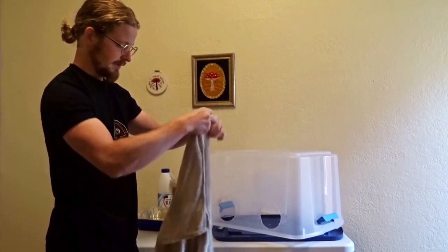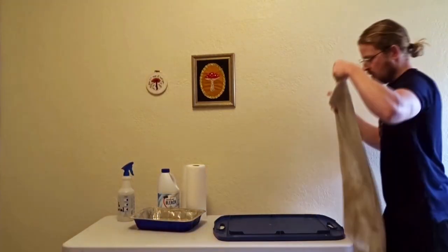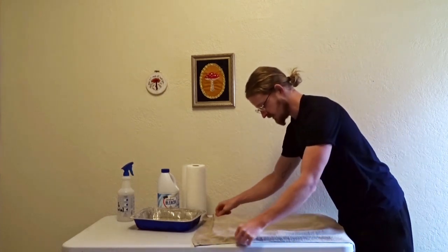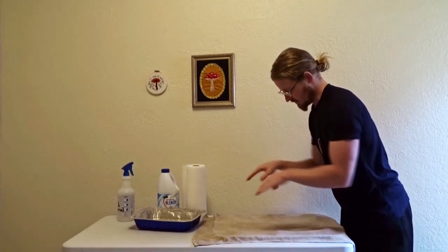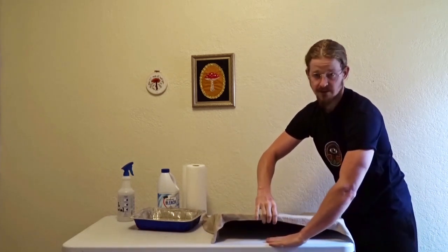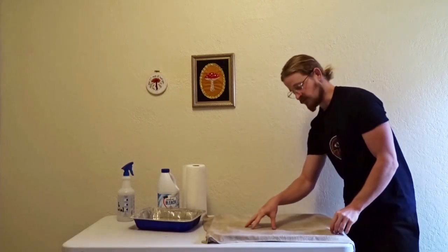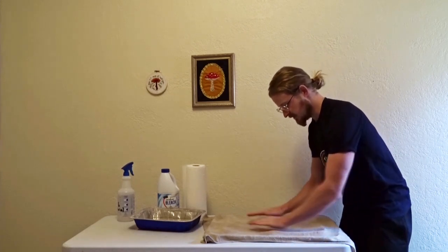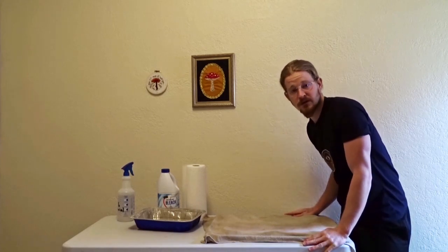The final step: get your towel out and lay it across the surface you're going to be doing your work on. I like to use the top — this is a locking container, so when I put it on it locks right in. You can also just use the table and lay your towel across the table. Make sure your towel is tight, taut — no ridges, bumps, or lumps.